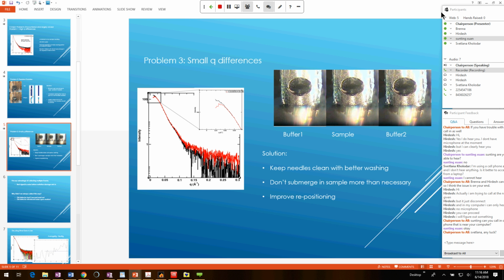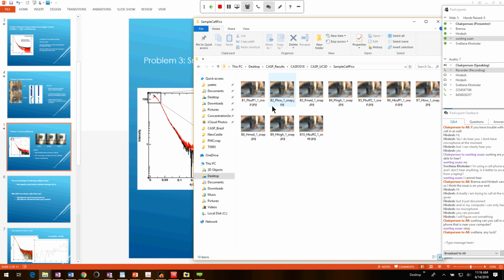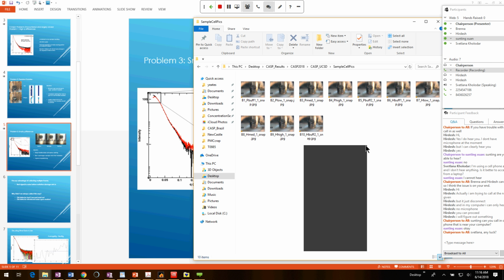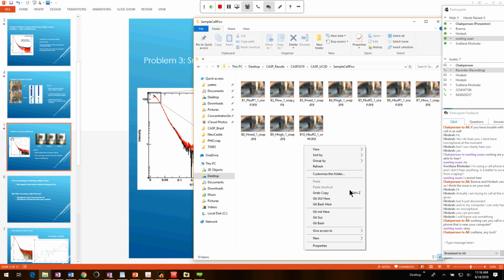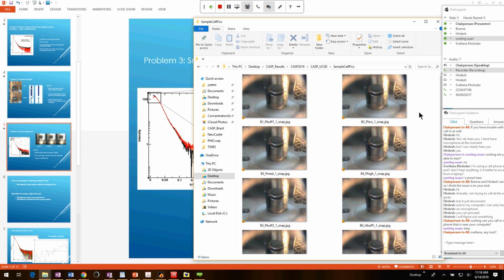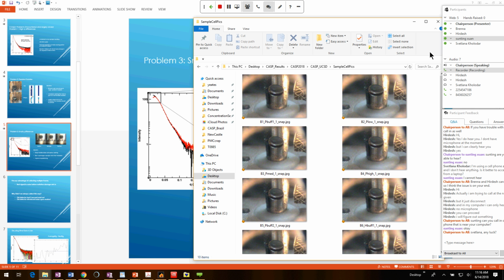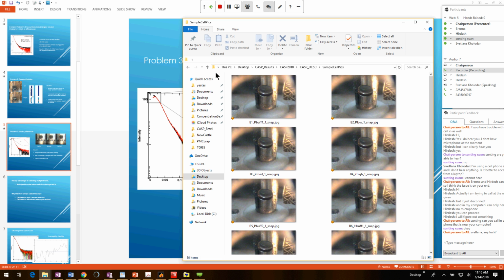Let me move over here to I've collected a sample for UCSD. Sample pics look like this. You can view them, and use whatever viewer you can to just screen through the images, or you can click them one by one, just to make sure that there's no bubbles in any of the samples or buffers, so you can look through that.